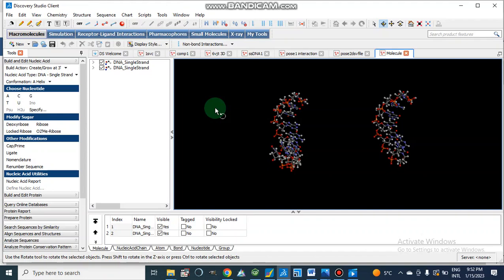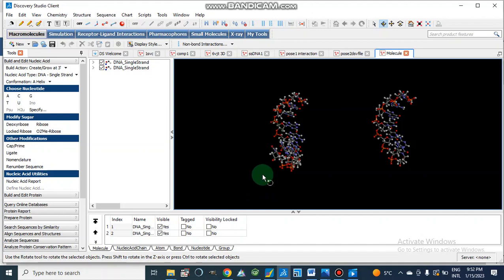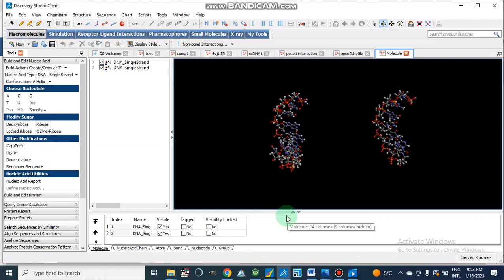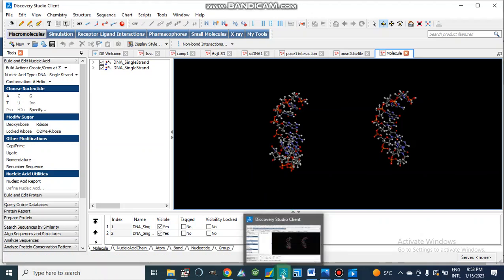Dear viewers, Assalamu alaikum. Today we will discuss DNA-protein interaction. Before this we have studied a lot on enzyme-ligand interaction in which the ligand molecule was a small molecule. But today we will discuss the docking studies of DNA and protein, and both are macromolecules.